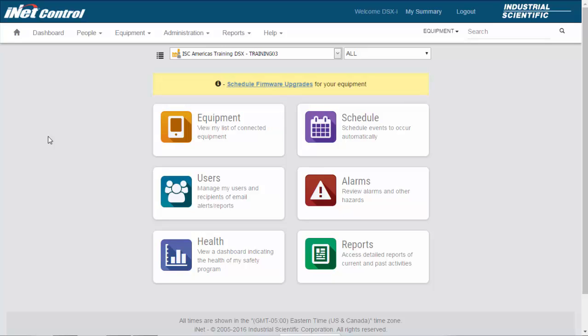Equipment groups. Equipment groups are used to group instruments into different work areas. These work areas are named by you, the admin, or any user that you designate that can create equipment groups.